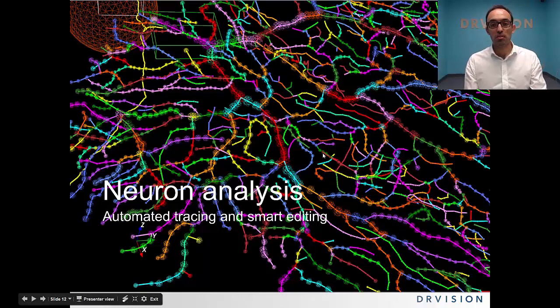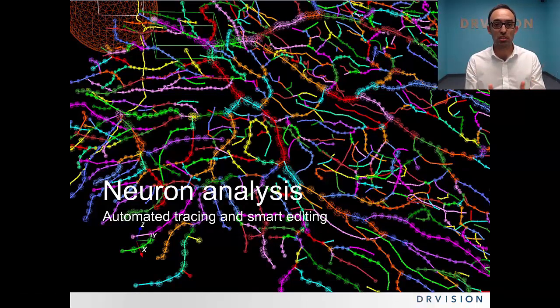So the first part of the actual presentation of Aivia 5 starts here. I'll talk initially about neuron analysis. It's an automated method which we have been working on the last 4 or 5 months. After that, I'll pass over to Bryce, who will introduce the immersive image exploration with the help of Hoyen, who will be doing the demonstration.